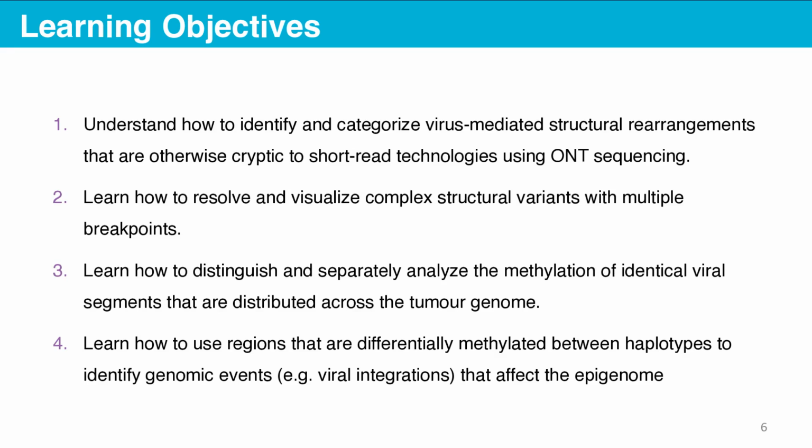Third, learn how to distinguish and separately analyze the methylation of identical viral segments that are distributed across the tumor genome. And fourth, learn how to use regions that are differentially methylated between haplotypes to identify genomic events like viral integration that affects the epigenome.